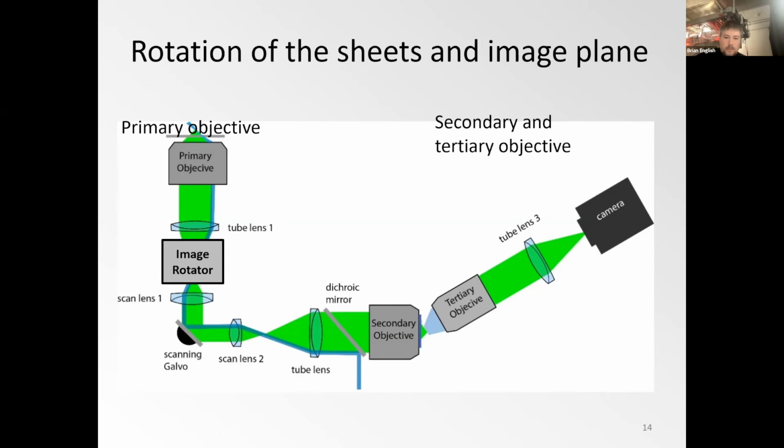Yes, in principle, I agree with Dan. If you design it right, you could probably create a Fourier space that could make do with smaller mirrors. But we simply didn't want to change too much the optical train that was working.